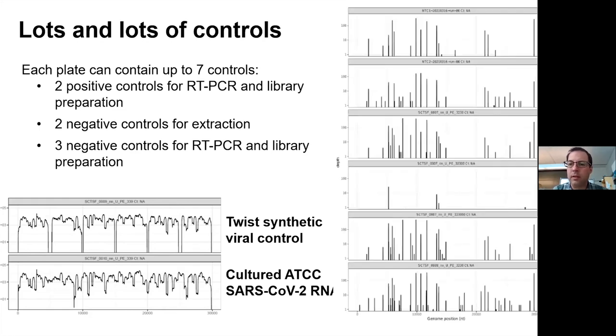On the right here, there are several negative controls. Sorry, I have to move my little window here. The top 2 are extraction negatives. So like I mentioned, these would be viral transport media going through the entire process. These generally want to be quite clean. And these little spots of coverage are random reads that map to the viral genome at levels of 10 to 100 reads. This is just for comparison. These runs are from batches that are sequenced to, on average, 1 to 10,000 reads per real sample. So we're talking about a sub 1% contamination level for the NTCs here.